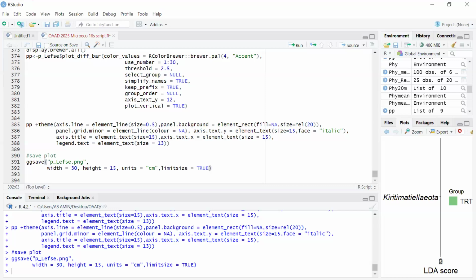But our webinar today is actually for community analysis. We are trying to understand the bacterial community using the 16S analysis. So it will be very difficult to say how you can single out one bacterium from that kind of sample. If you need to, you just have to take each colony that is morphologically different from each other, then do the sequencing and know which one is different from which. I don't know if this gives you more information.